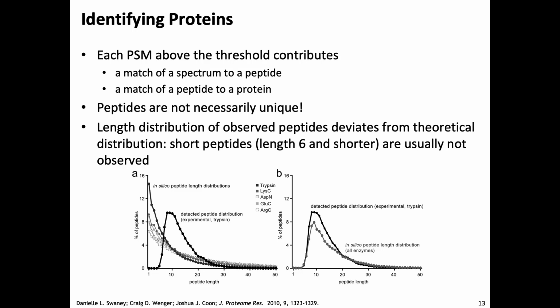Could you speak up a bit? Shorter peptides are just not going to be retained by the column. Yes, that's one of the problems. We usually also filter out these masses. Why don't mass spectrometers care about peptides of length 3? The odds of finding this sequence in a proteome are pretty good. You will find it everywhere.